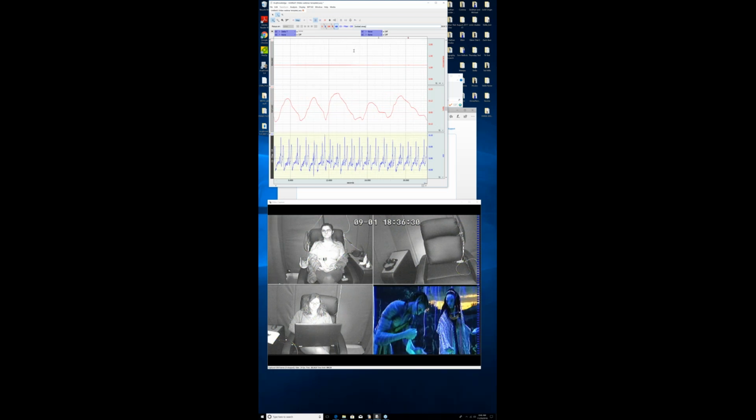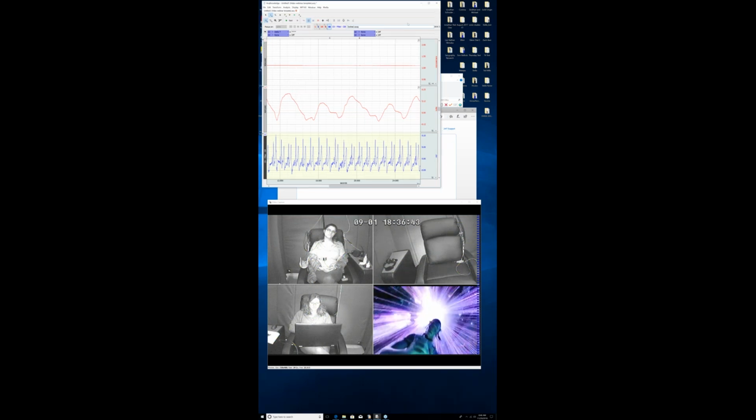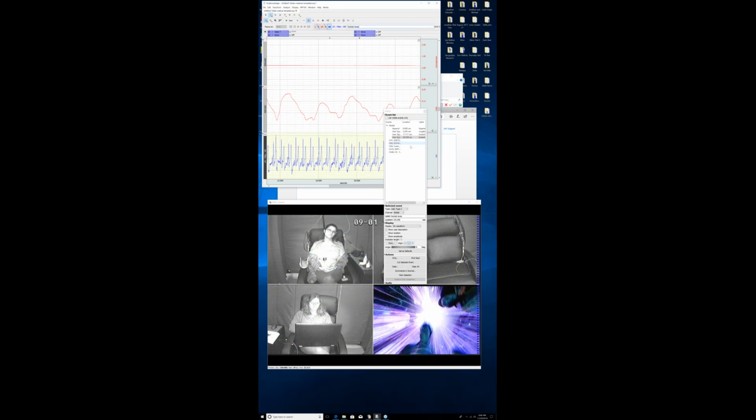And then when we stop recording, it's a little challenging on this display. Let me just adjust this a little bit so we get a better view. Here we go. So down over here, we have a list of the events that were put in there and the channels that were collected.